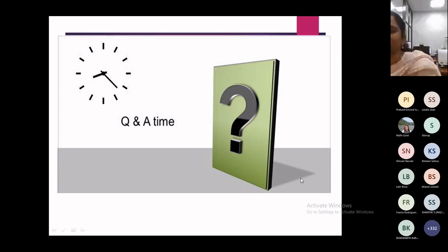As far as the heating cycle is concerned, we have seen one slide that you can perform a 3-step specific heat determination. One is the empty pan, second one is the sapphire disk, and third one is your sample. This 3-step determination will give you the change in specific heat with respect to temperature. In a similar fashion, if he wants to perform in the cooling mode, he can use the same methodology. As far as cooling is concerned, I never heard about people determining specific heat that way. I'm not 100% aware about this part, but in heating, yes.